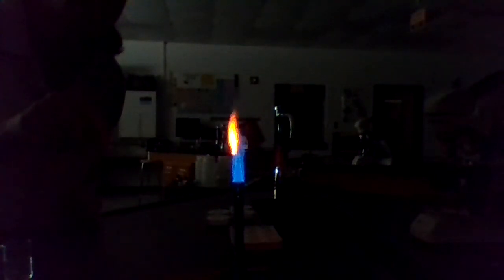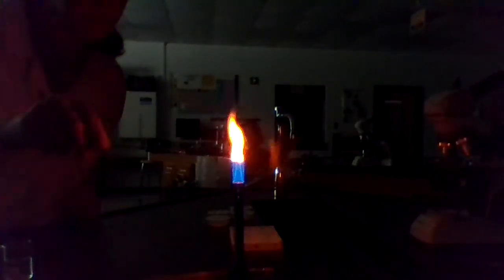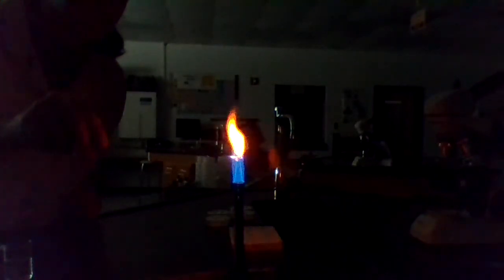All right, we're going to burn it one more time. Oh, you can see the red. Yeah, there's bright red on there. Pretty red color. Yeah, burn it all off, and then you'll put it in the. Wait. It's hot. Yeah, I can tell.